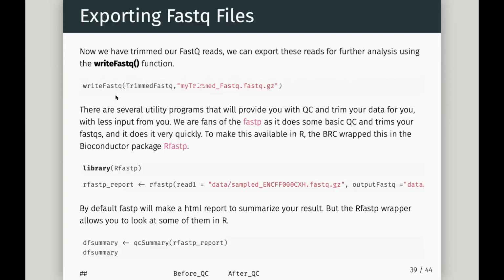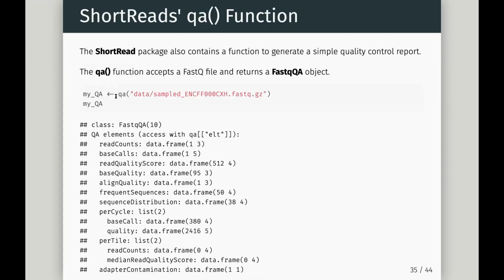So we have a few different ways of doing quality control. One is using our own package, and one is using ShortRead. Okay, so actually for quality control, just quality control rather than reviewing your FastQ reads directly, I recommend our fastp, which is super fast, and we wrote it because this is too slow.